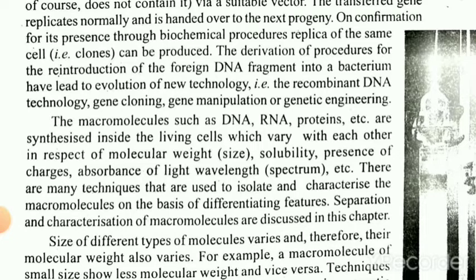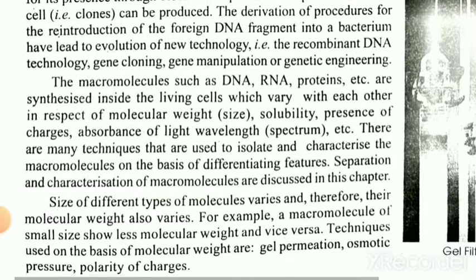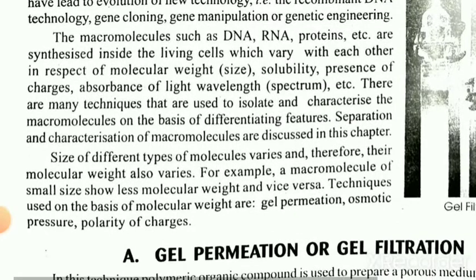The macromolecules such as DNA, RNA, proteins, etc. are synthesized inside the living cells, which vary from each other in respect of molecular weight, size, solubility, presence of charges, absorbance of light wavelength spectrum, etc. There are many techniques that are used to isolate and characterize the macromolecules on the basis of differentiating features. Separation and characterization of macromolecules are discussed in this chapter.